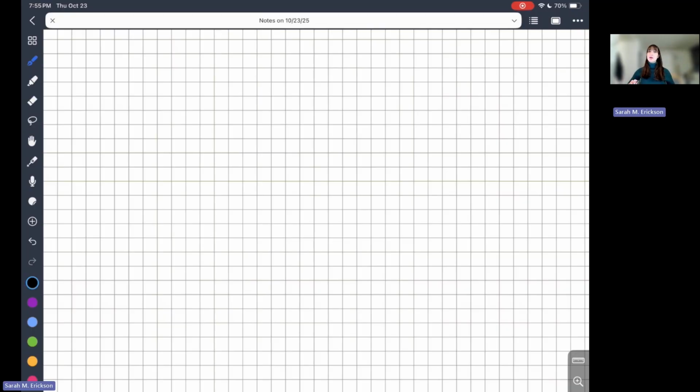The very first thing that I want to do is walk you guys through how to use the dilution equation in order to find the concentration of the solutions that you made in lab, because we'll need that to make our calibration curves, which we're going to do next. If you're comfortable with the dilution equation and you've already done that, you can just ignore this part of the video and fast forward until I start talking about Excel spreadsheets.